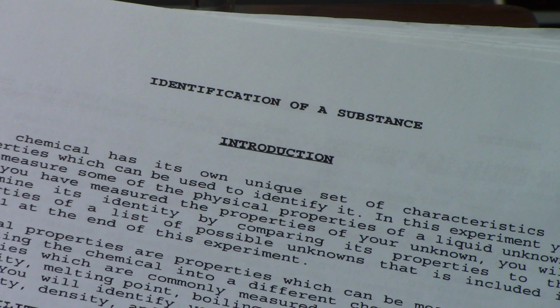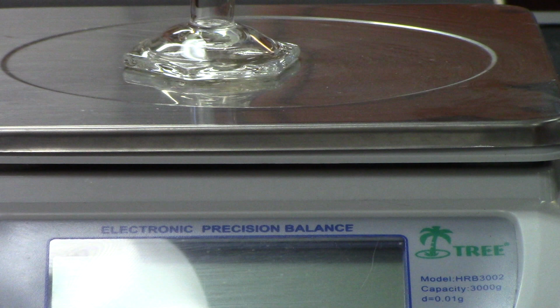You're going to be recording its mass. I'll be getting its volume, and you'll be recording its volume. And then finally, on the third part, the boiling point, you will be recording the boiling point. Okay, so let's get started here.